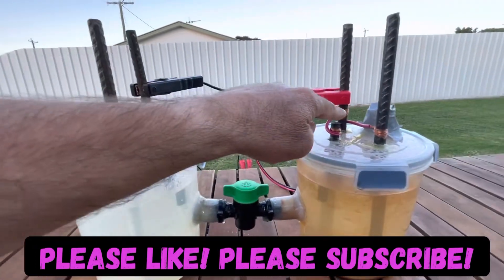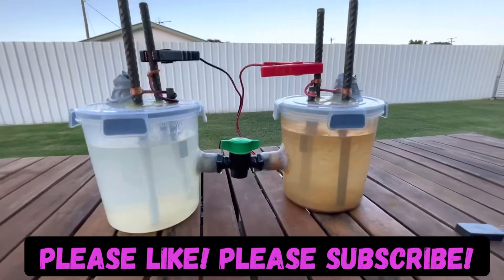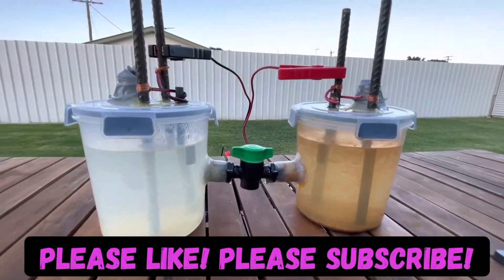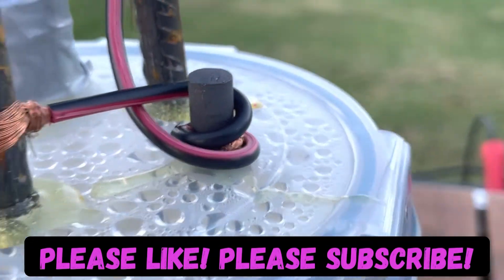Measured from this point, it was producing almost a volt of charge as an electrolytic cell, like you would in your dry cell batteries. And because it's all connected up here — you can see the wiring I've got connected from one side to the copper cell, and that's to the carbon rod.